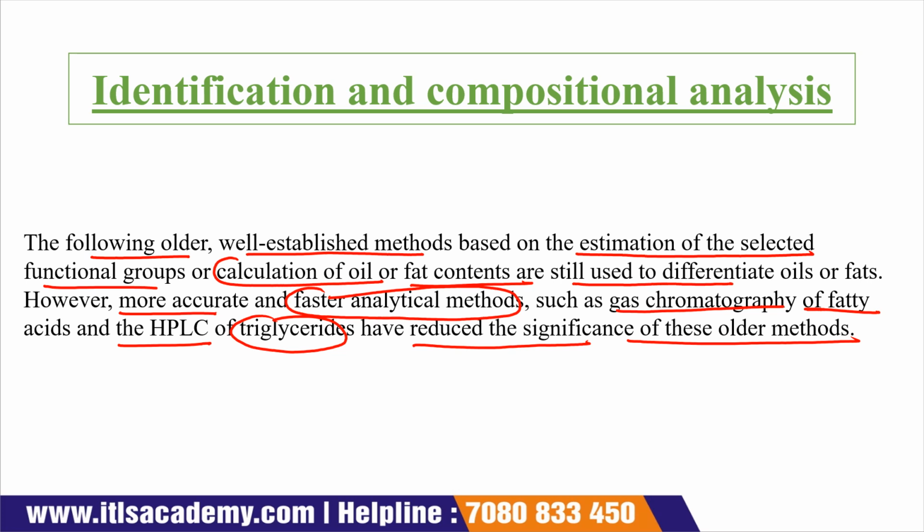So before the faster analytical methods were introduced, the older methods were used. That means the estimation of the selective functional group or the calculation of the oil or fat content was used to differentiate oil or fat.